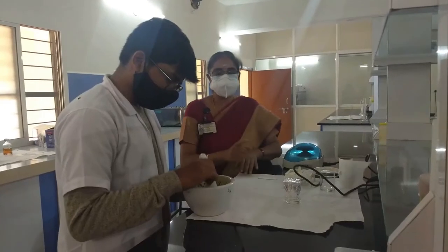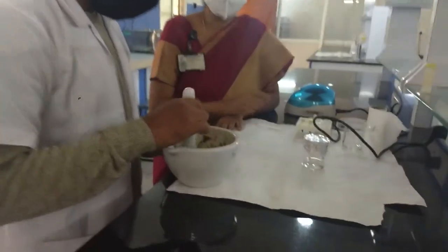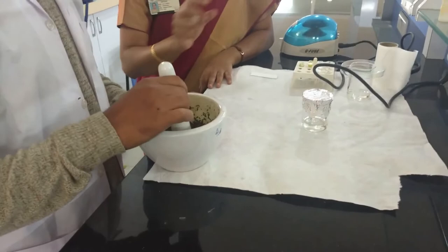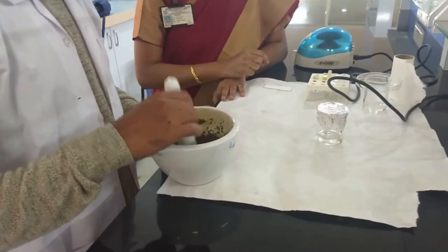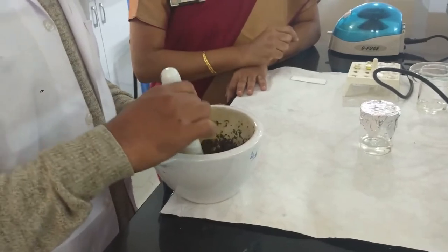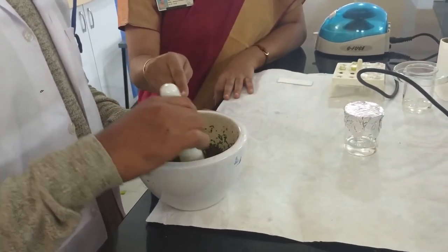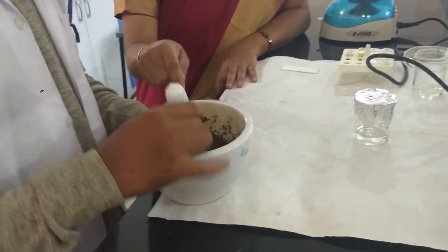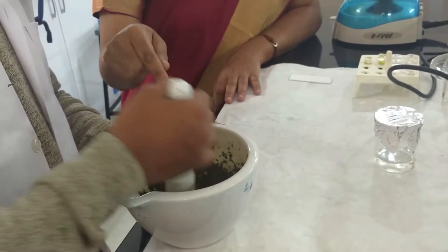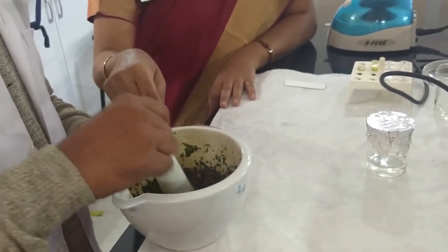The second step is preparation of the sample. We have taken carrot and palak (spinach) as samples for today's experiment. Take a few grams of the leaves only, and a small piece of carrot diced into small pieces, and transfer them into the mortar and pestle to make a smooth paste.